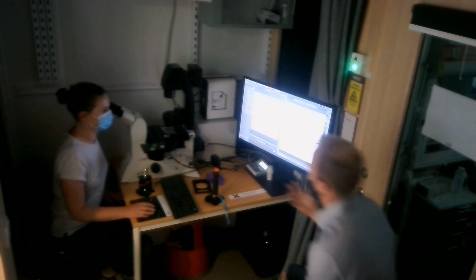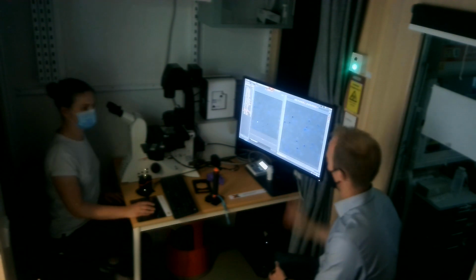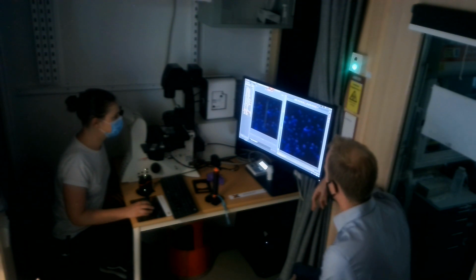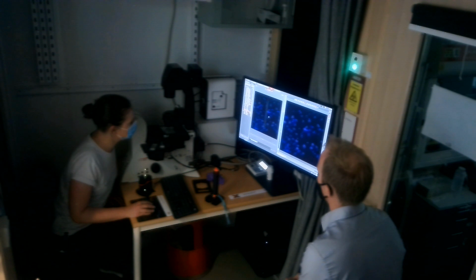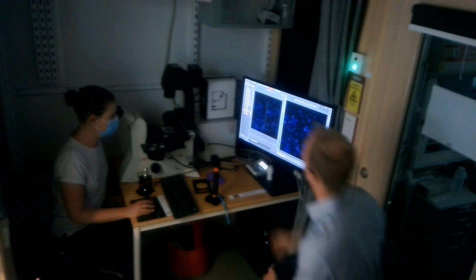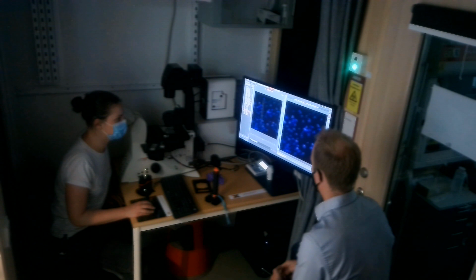Now it will create a copy. You will see the copy coming up there. There you go. It gives you the name, and it adds something at the end of the file name. Now if you remove the channel 2 maybe, this is the projection image that you get. Where's the line here? This is a line to show before and after. Some of the things that you do in Process, you can see a sort of preview of what it will look like. In this case, right now you're also looking at the processed one. In some of these tools they don't really give you before and after either. But this is the result, the final one. Okay, nice.